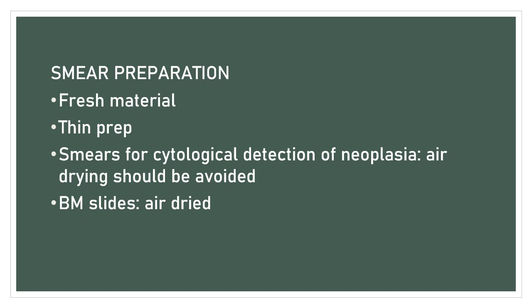It should be a thin preparation, with even distribution on a slide. The smears for cytological detection of neoplasia should not be air dried. Air drying should be avoided with smears for cytological detection of neoplasia because it changes the appearance of the cells. The appearance of the cells is actually altered.